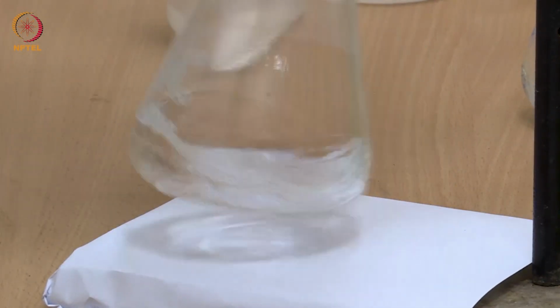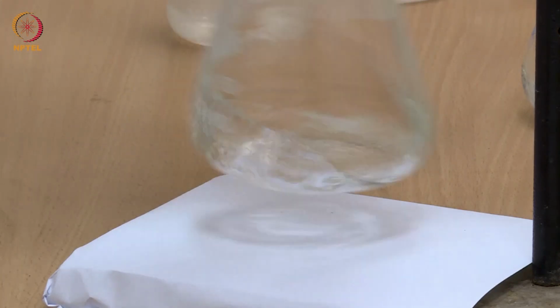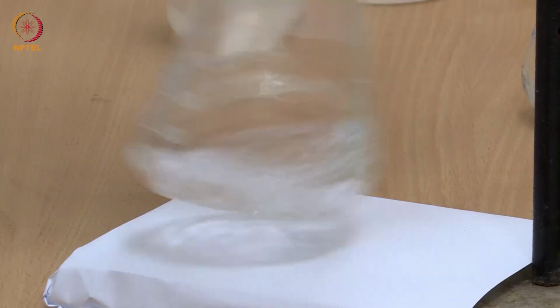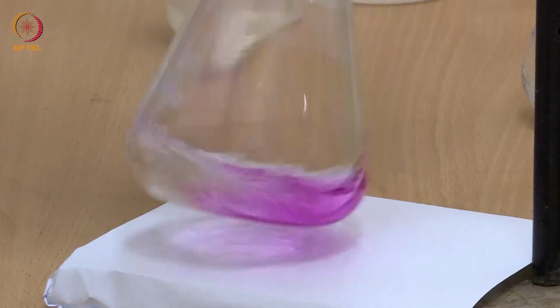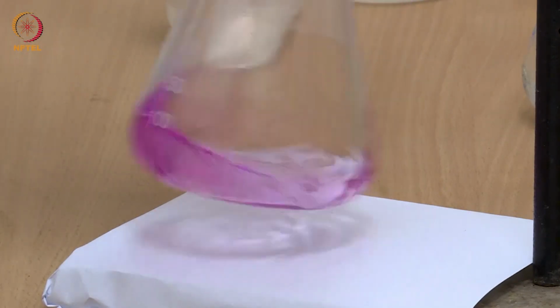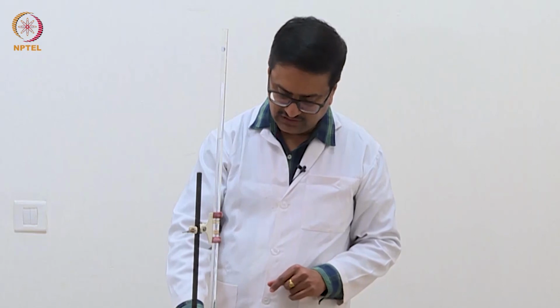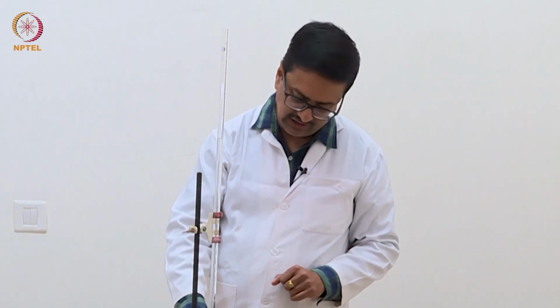Now you see it is taking much longer time than before to completely decolorize. So we are very close to the end point. See now, with one drop the color has become pink and it does not change on shaking or stirring, which indicates that we have reached the end point of this titration.